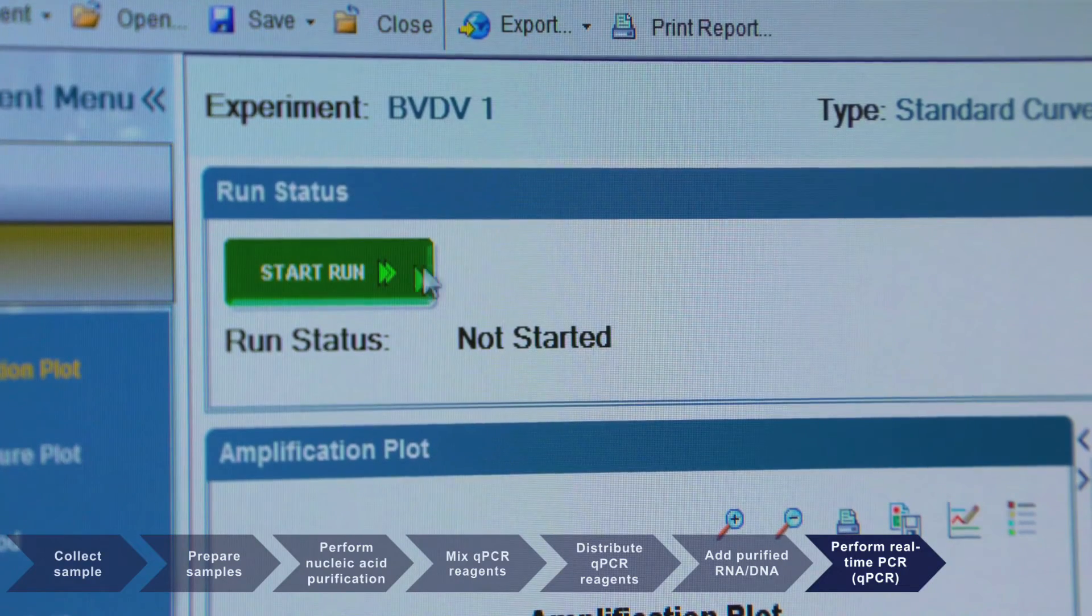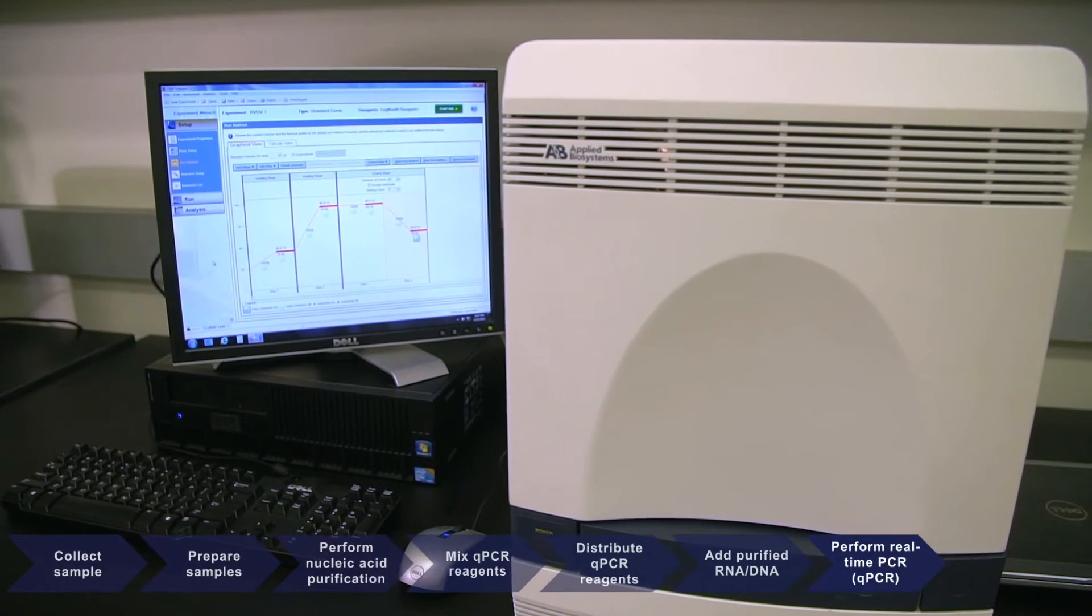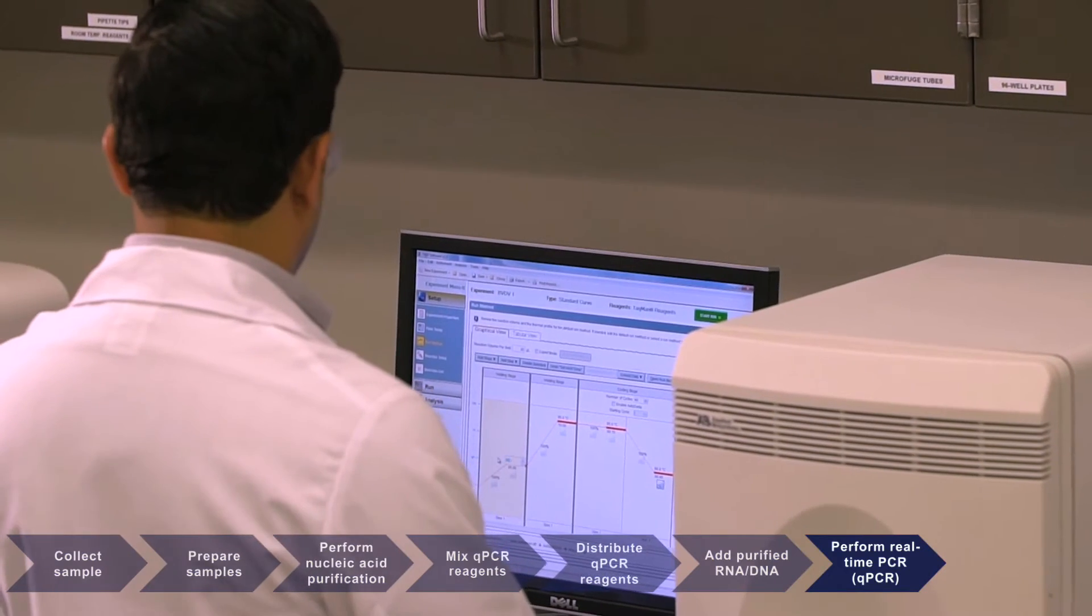As the PCR run proceeds through the program, an amplification plot is generated, determining the normalized fluorescence with each cycle.